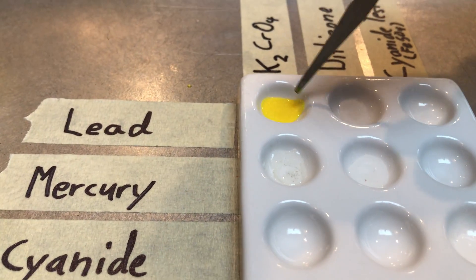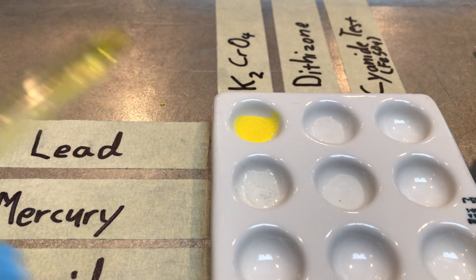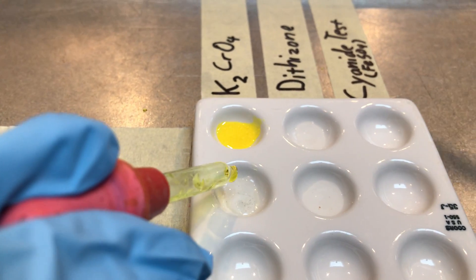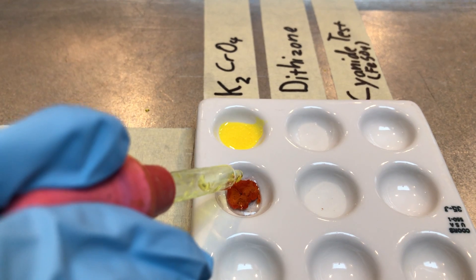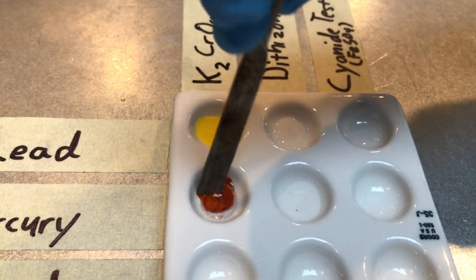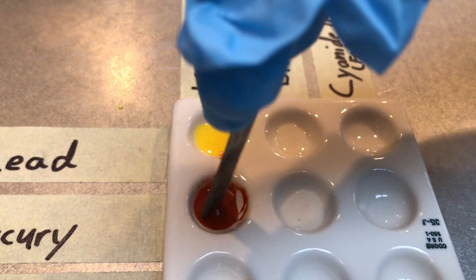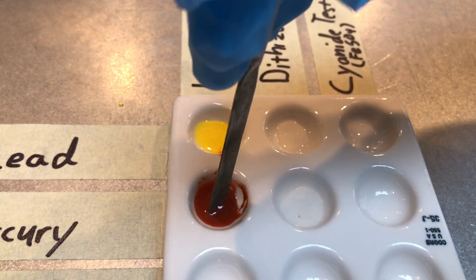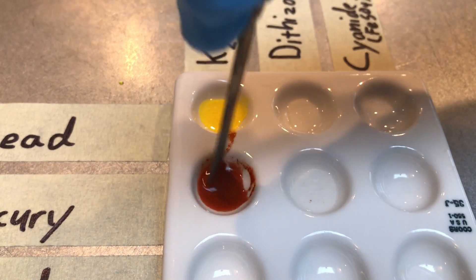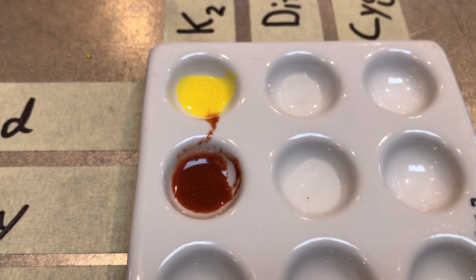James, would you now add two drops of the potassium chromate to the mercury? Liam, give that a good stir. So once again we see a precipitate, but in this case it is kind of a dark orange precipitate. We can see that kind of solid powdery type stuff starting to form.